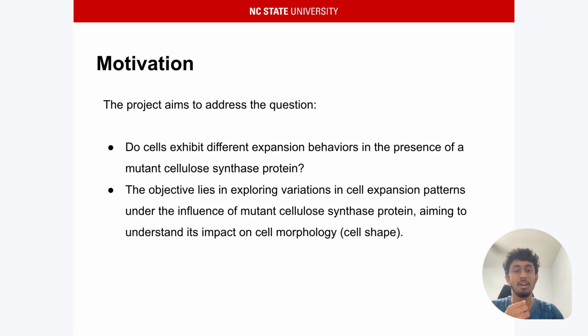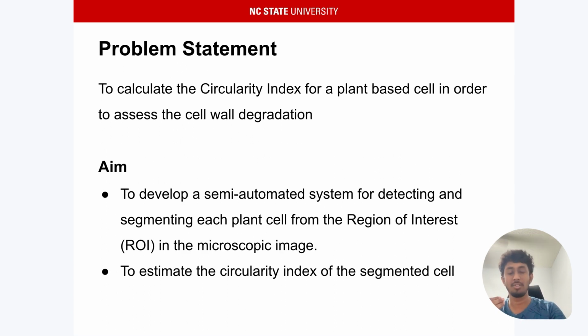And for this reason we are calculating the circularity index, and for this we are building an instance segmentation model which segments each and every cell present in the image, and we map those features to this image to calculate the circularity index.